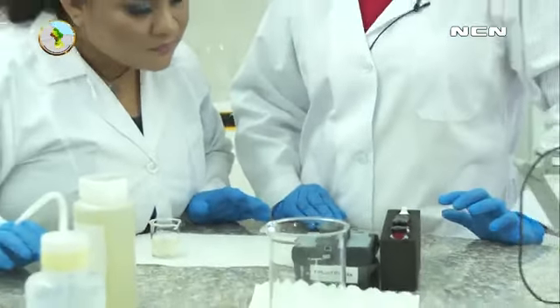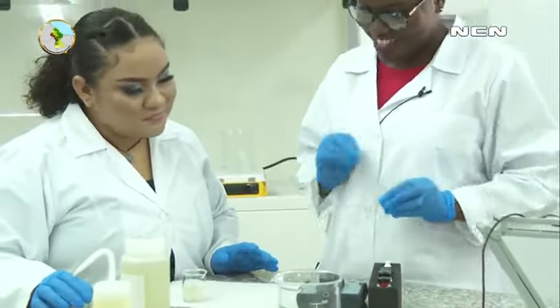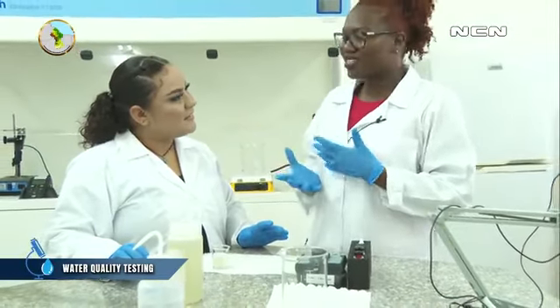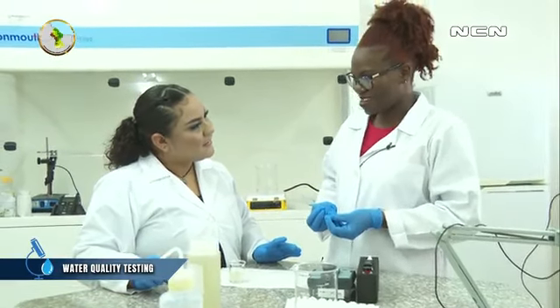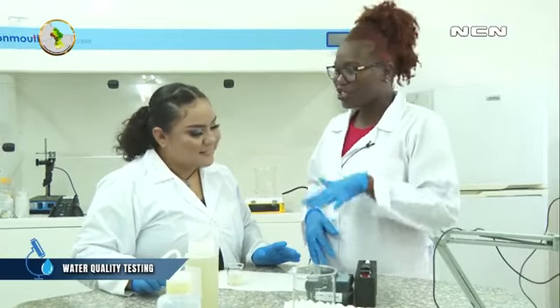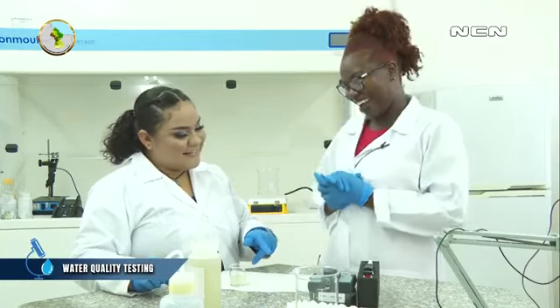Now what turbidity is all about, it's about aesthetics. Because the prettiest water is the nicest water to drink. So what value do we have? 30.1. And when I told you turbidity, what value are we really looking for that's the best water for us to drink? 5, right? So what does this mean? We should be consuming that water? No. So this is too high of a value for us to be consuming. This is way too high? Way too high.